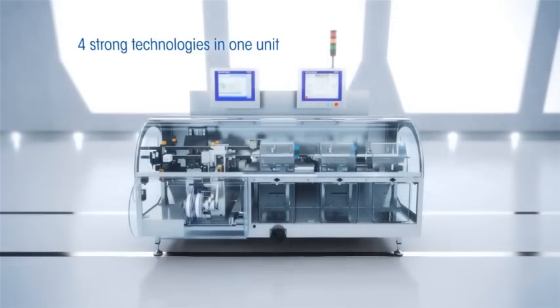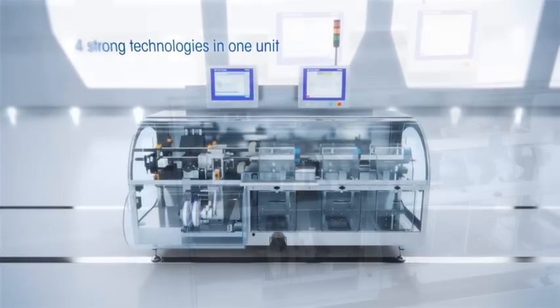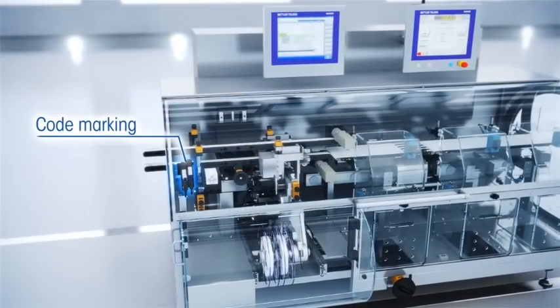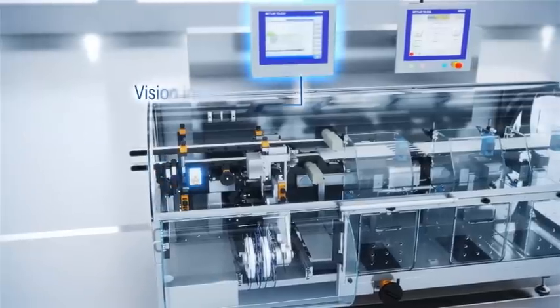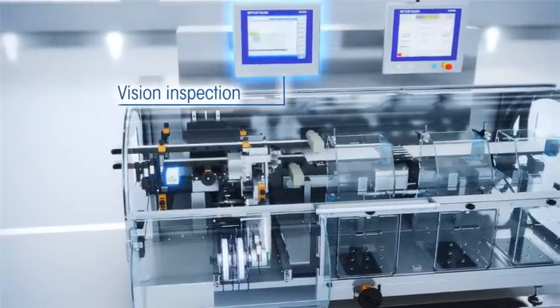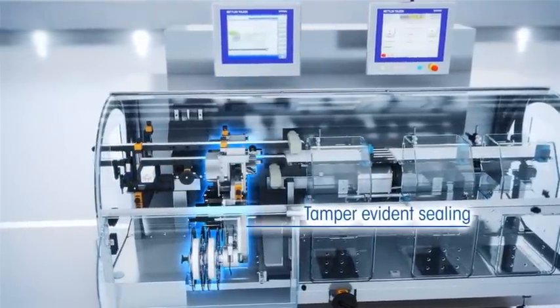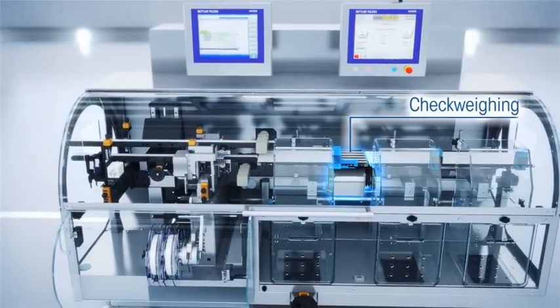It combines four strong technologies in one compact unit: serialization code printing, vision inspection, tamper-evident sealing, and completeness control.